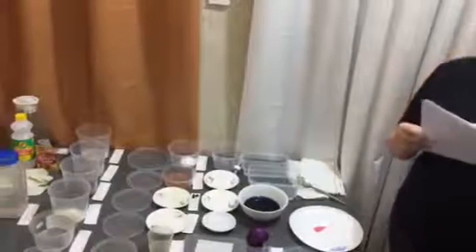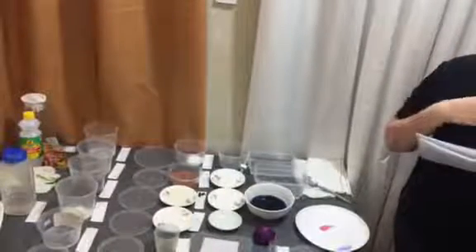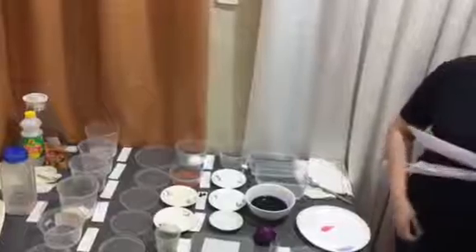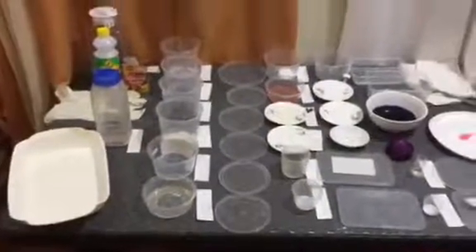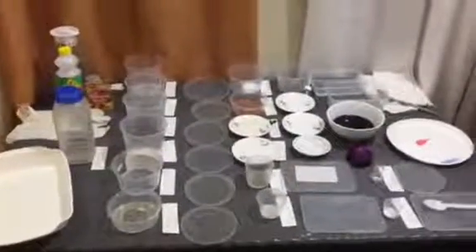I don't have goggles, so I use a laboratory coat or another layer of protective clothing like this. Closed shoes, then gloves. I will be mixing first those materials here.